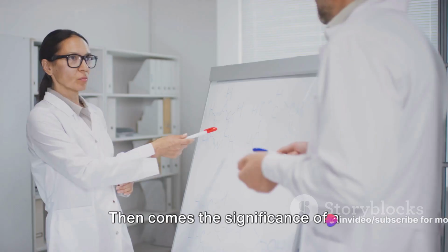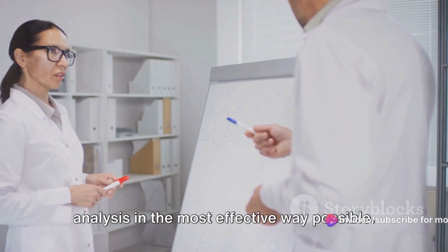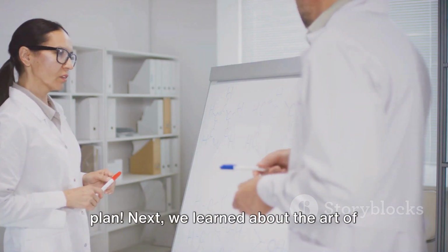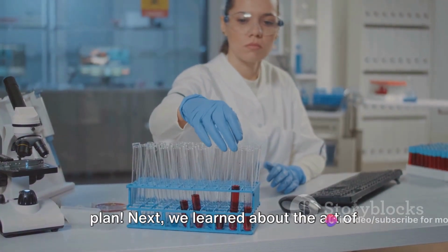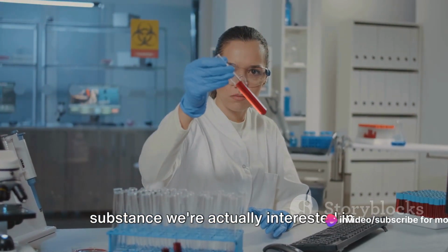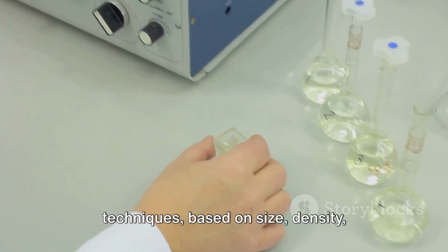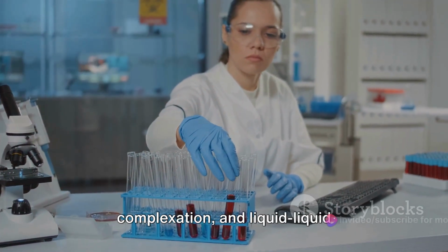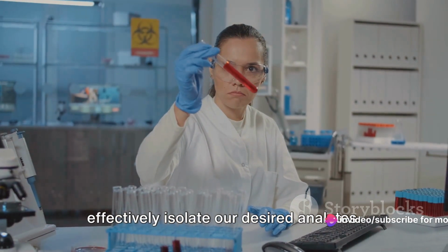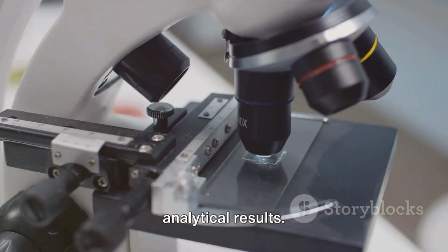Then comes the significance of a well-structured sampling plan, which provides a roadmap for conducting your analysis in the most effective way possible. Don't underestimate the power of a good plan. Next, we learned about the art of separating analytes from interferents, a crucial step that helps us to focus on the substance we're actually interested in. And finally, the advanced separation techniques based on size, density, complexation, and liquid-liquid extraction give us the tools to effectively isolate our desired analytes. All of these steps combined ensure the accuracy and reliability of your analytical results.